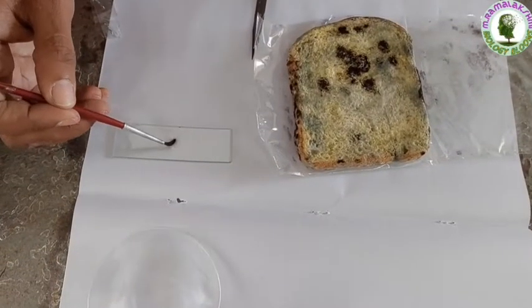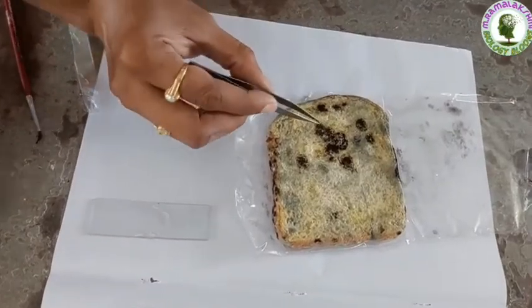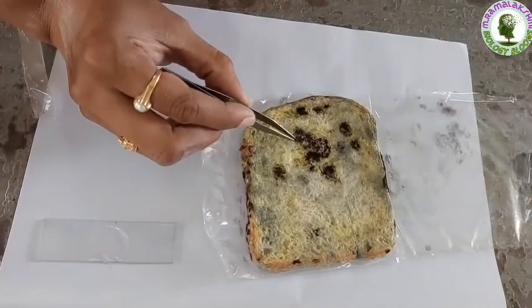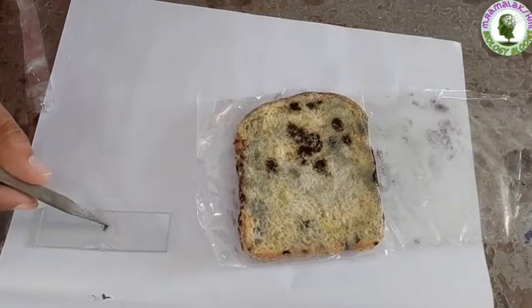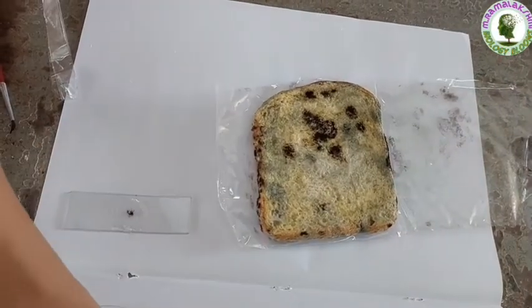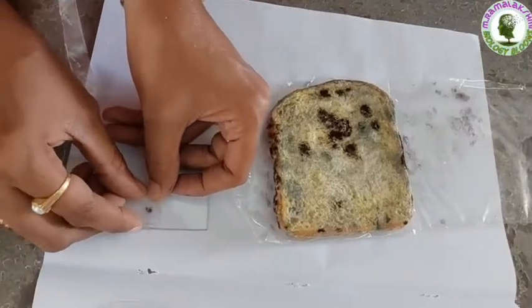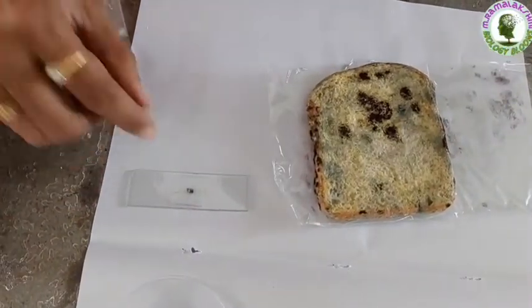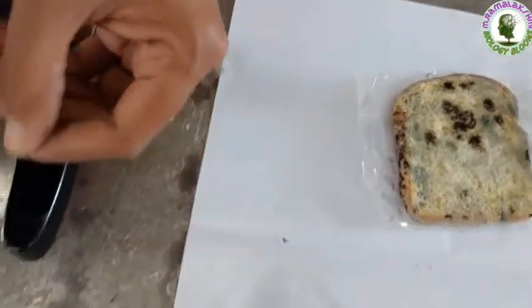To observe this, place a drop of water on the slide. Using forceps, scrape very little of the mold and place it on the drop of water. Cover it with a cover slip, without having any air bubbles. Now place the slide under the microscope and observe it.